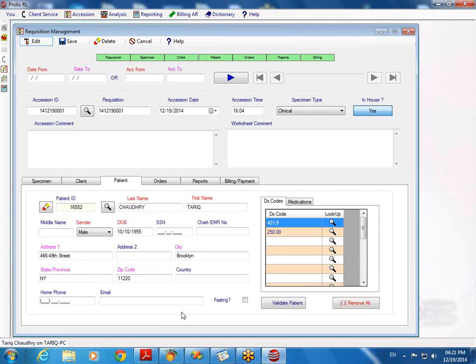So oftentimes we'll be recording, let's say, when a patient received surgery, or whether they had a negative outcome at surgery, things like that. Yes. For pathology, our software supports synoptic pathology. That means you could configure the test for pathology purposes, and those are the composite tests. Each piece of information goes into the children tests.